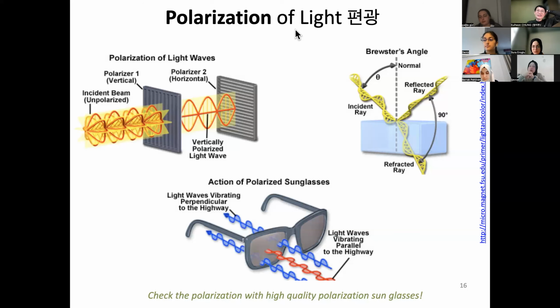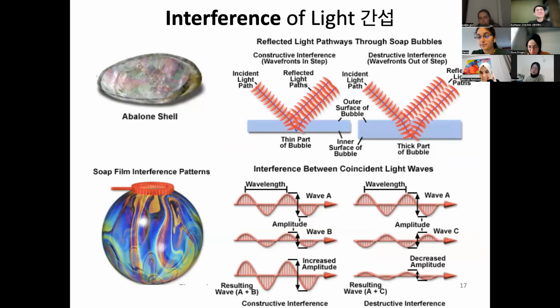This is only another aspect of the light. I didn't cover the electromagnetic field much, but this is the electric field, and it can be composed of many different angles. And just a practical tip for you: you may want to use sunglasses which are polarized. They are more expensive, but they help you in blocking light.